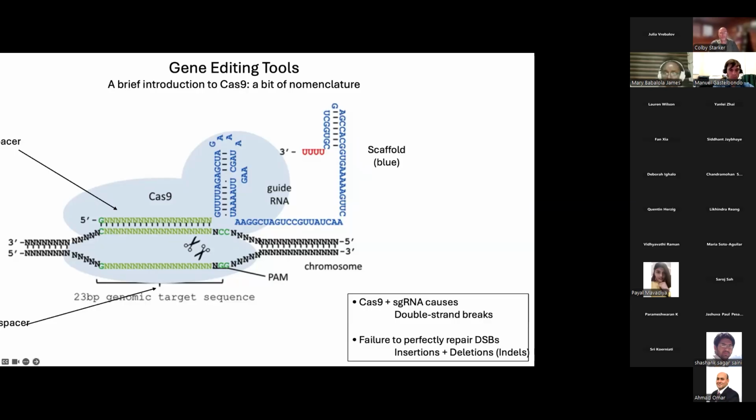Right. Okay. That answers it, because I was thinking that, but I wasn't sure based on this picture, because usually they present this picture like this, and it's like, okay, what's going on? Okay, I'm all good. Thank you. Yeah, in the beginning, I used to have to refer to this picture more often than you would believe. I refer to this as a plus and a minus strand: the sense strand follows the strand that I put in, and the reverse one is the antisense. All right, thank you. You're welcome.